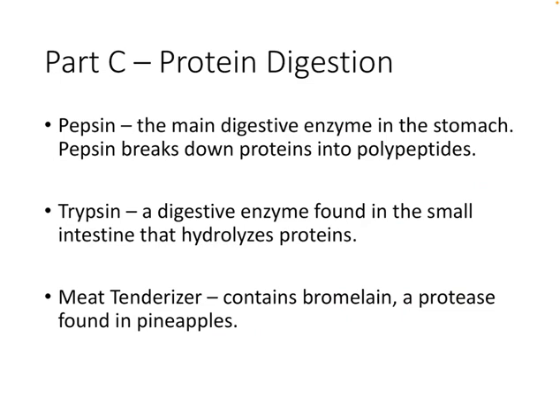In part C of the lab, we're going to look at how different enzymes may or may not break apart proteins. So this class of enzymes are called proteases. And those are all shown down below.